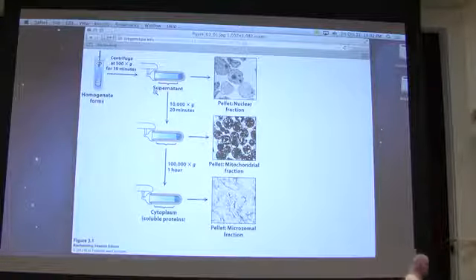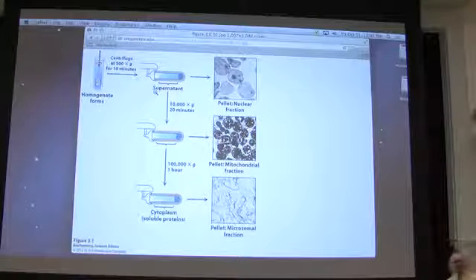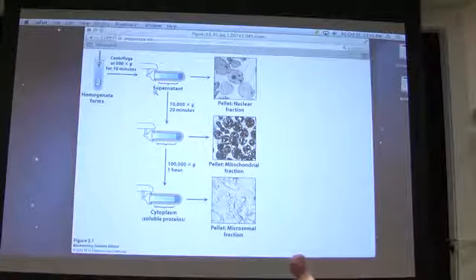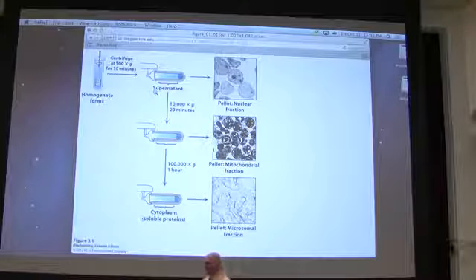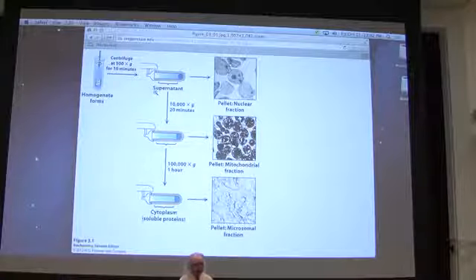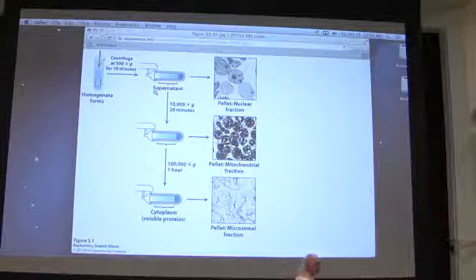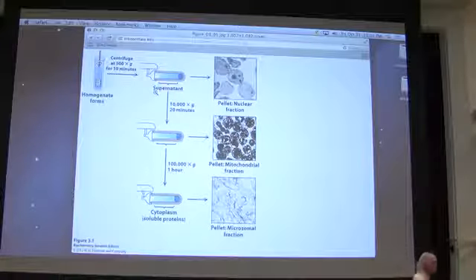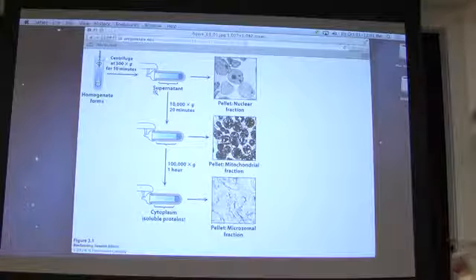Well, as I said, centrifugation is a way that we start because we first of all have to get the material that is part of the cell. So the material that we're working with might be in the cytoplasm of the cell. The material we work with might be in the nucleus. It might be in the mitochondrion. Of course, if we're talking about eukaryotic cells. If we're talking about bacterial cells, then it's basically in the cytoplasm or it's in the membranes. And of course, it might be in membranes of eukaryotic cells as well. So we have to have ways of isolating these various components.